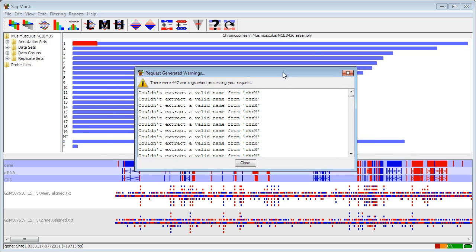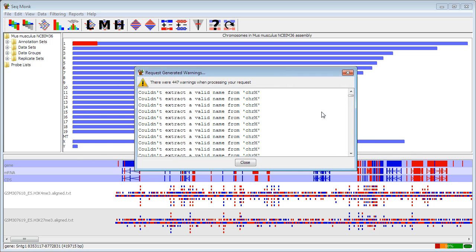Once the data is finished importing, you may or may not see a list of warnings on here. There are some warnings on here that are basically harmless and there are some that might be important, so you need to look through this. The first thing to see is how many warnings you got. So I've just imported somewhere around 20 million sequences and I've got 447 warnings. So most of my data was absolutely fine.